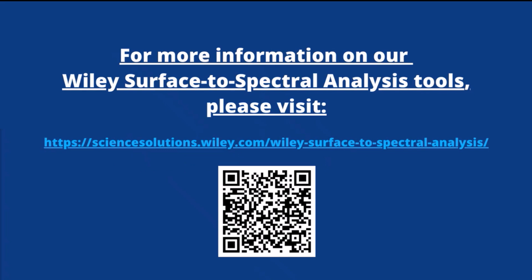Will this software be able to analyze FTIR spectrum? No, right now just Raman. No, it should be IR, Raman, UV-Vis are the types of spectra supported. Great, thank you for that clarification there. Let's see, a few more here.